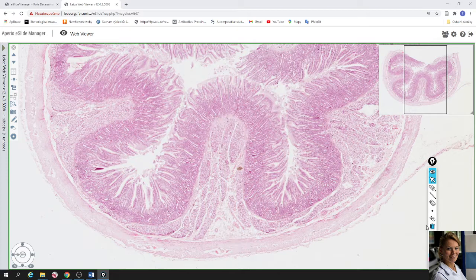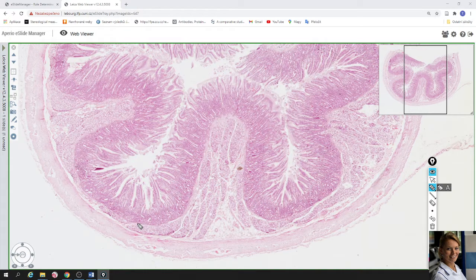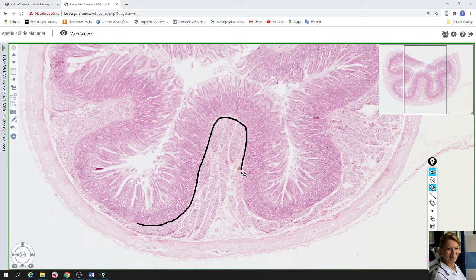For good absorption of nutrition it is necessary to have a large surface. In the duodenum you can find three levels for increasing the absorption surface. The first level is formed by plicae — these are circular folds formed by mucosa and submucosa. Here is one plica.